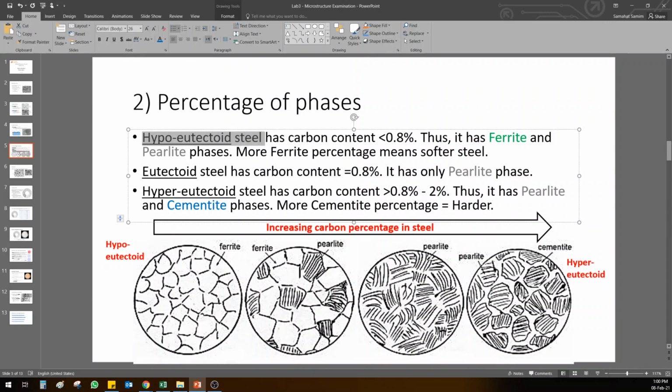This is just a reinforcement of the same information from the previous slides, where I said ferrite is softer, but it's a different name, or a different category of steel, they divide into. If you check the first picture on the left here, this is hypoeutectoid steel. Why? Because it is all ferrite. There is no pearlite inside, and it means carbon is less than 0.8%.